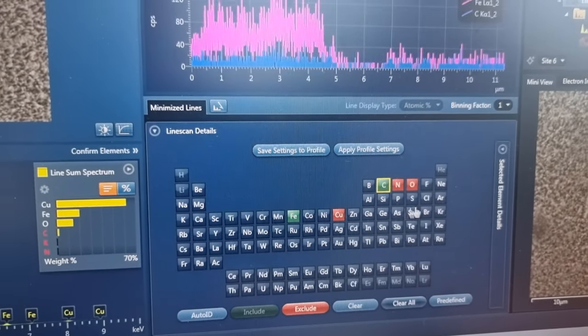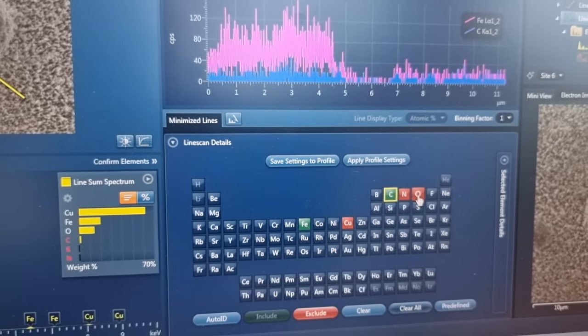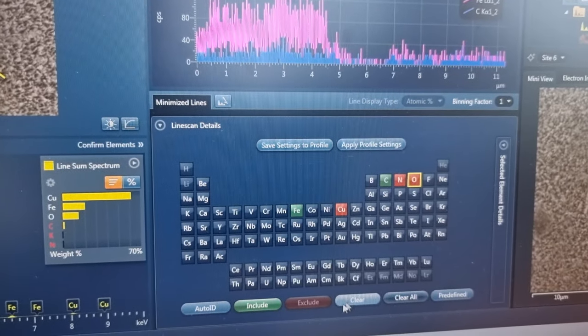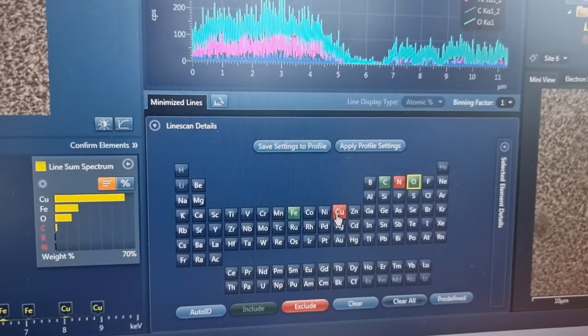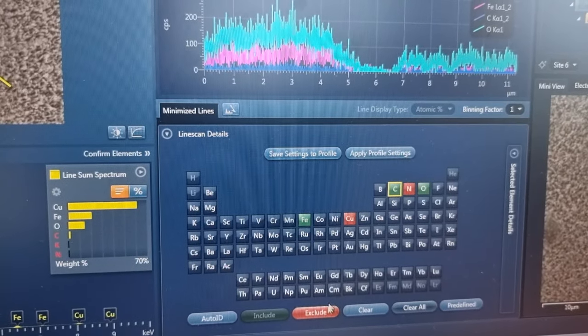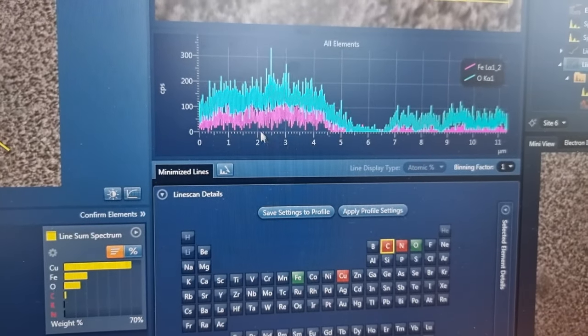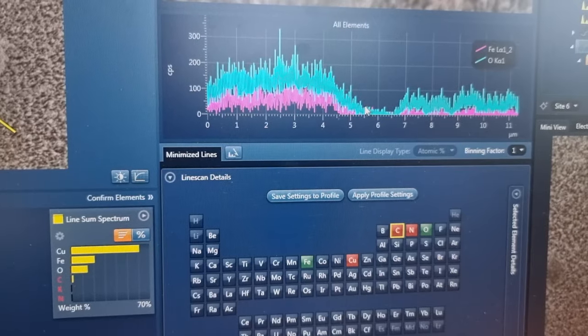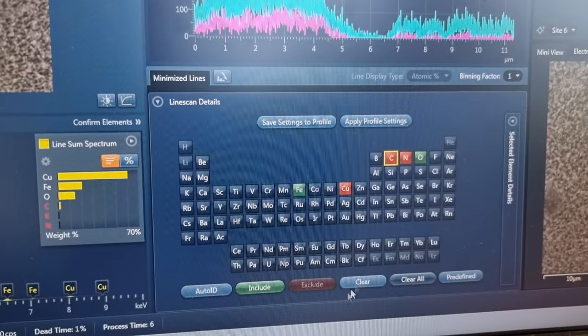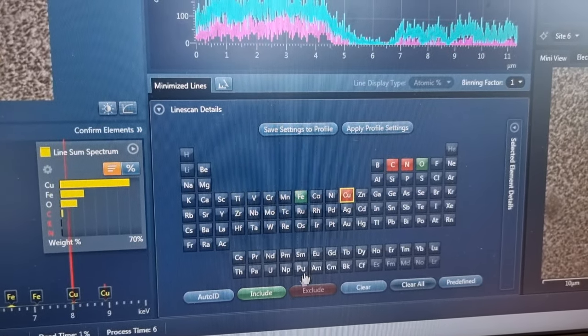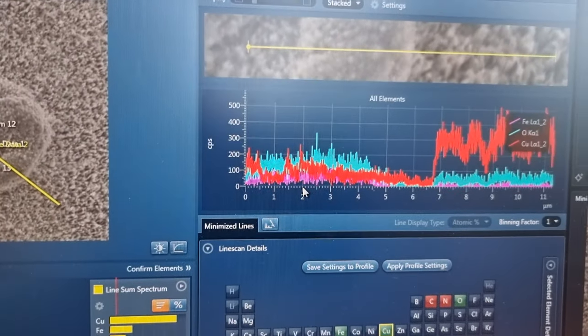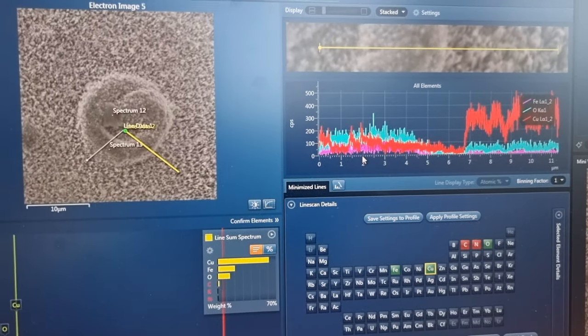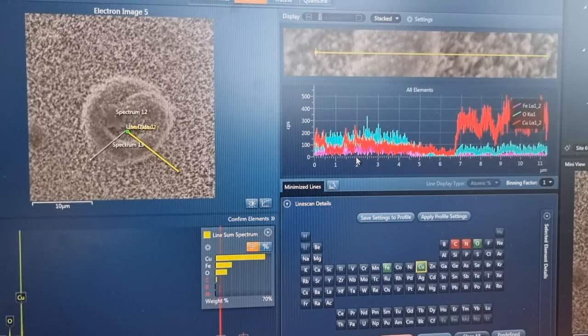There's a correlation between the iron and the oxygen. So the correlation there with the blue of the oxygen, and there's an anti-correlation with the copper. Very interesting, of a strike mark line.